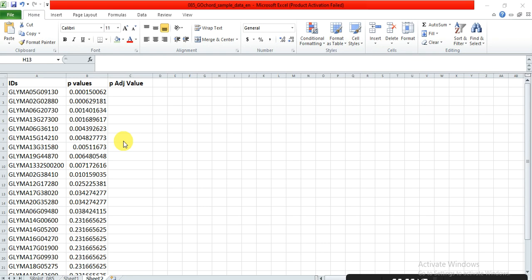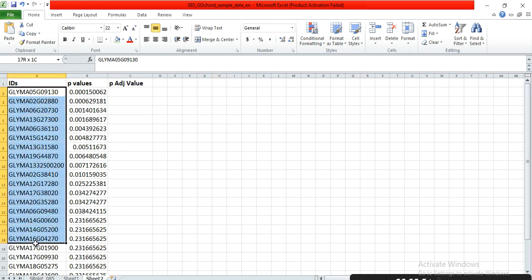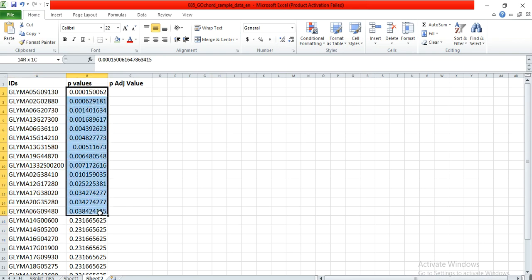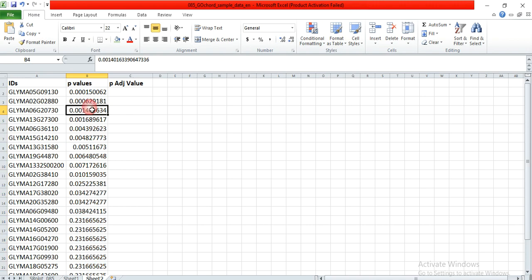Open the file that contains your genes. This is a gene list and these are their p-values or probability values from an experiment or through RNA-seq data that I have.